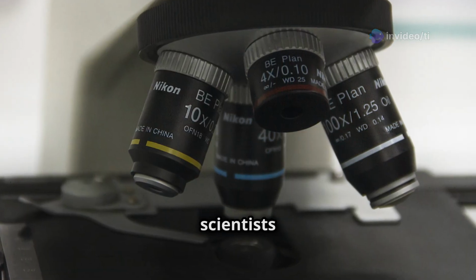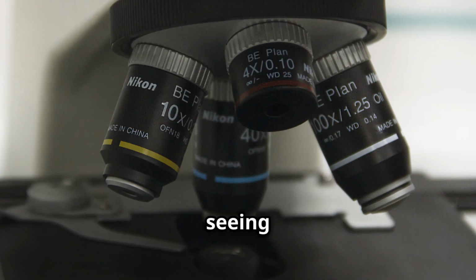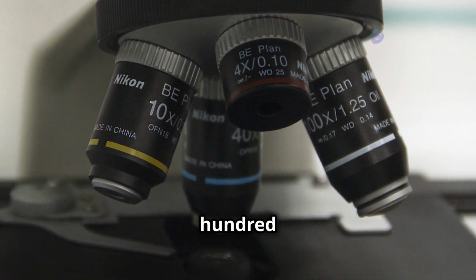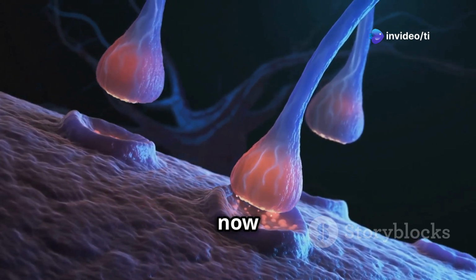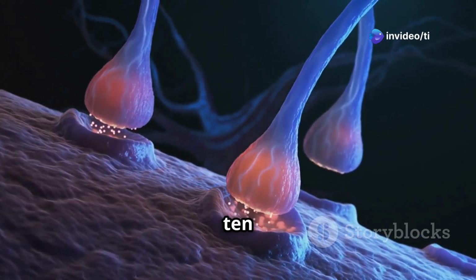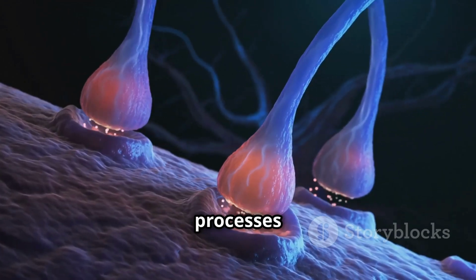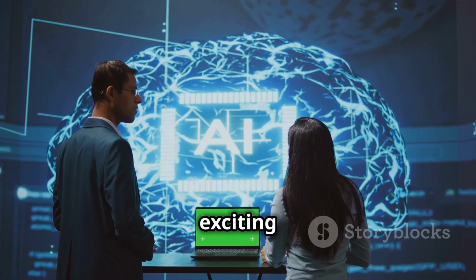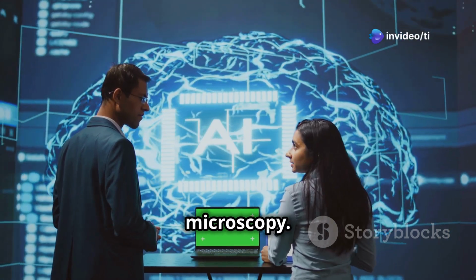These techniques allow scientists to break the diffraction limit of light, which used to be a barrier to seeing objects smaller than about 200 nanometers. With super-resolution microscopy, we can now visualize structures as small as 10 nanometers, revealing unprecedented details of cellular processes and interactions. Another exciting area of development is the integration of artificial intelligence into microscopy.